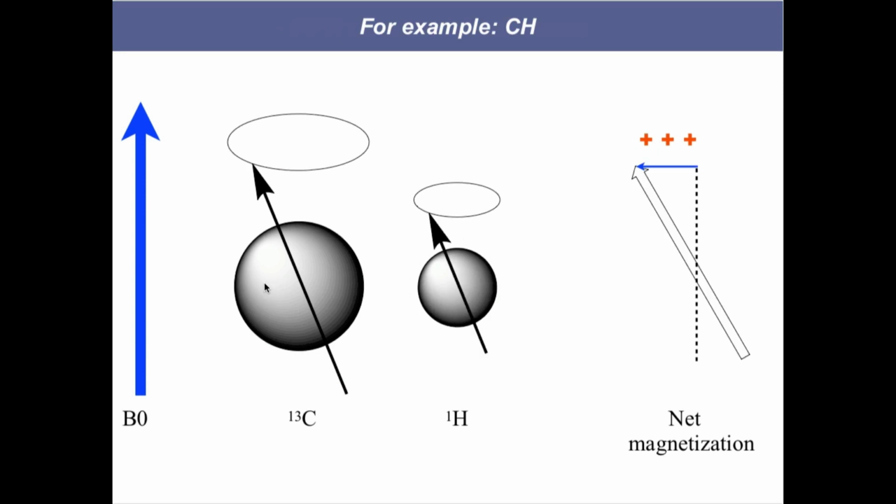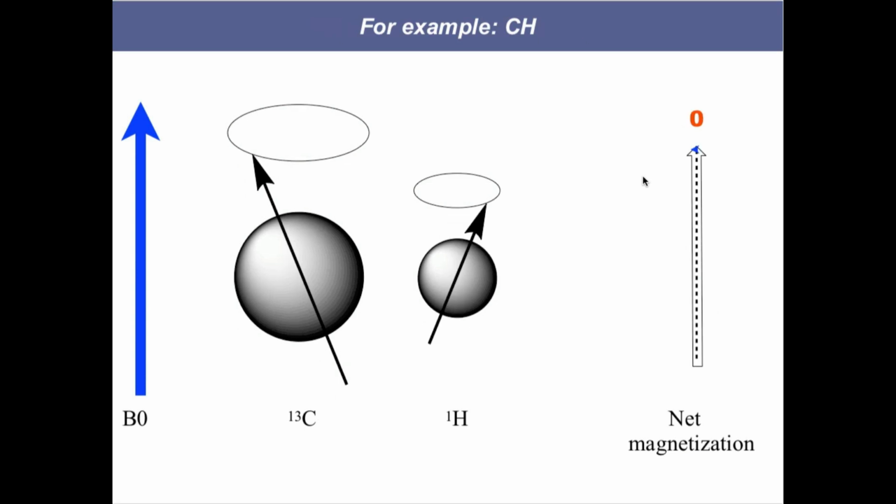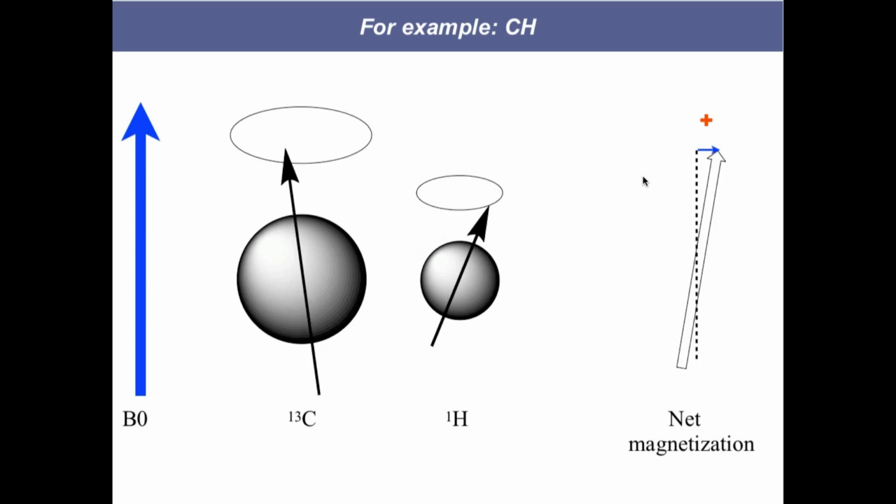So whereas before we had more magnetization, now we have less magnetization. If hydrogen keeps on spinning, we're going to have magnetization where maybe they cancel each other out. Maybe hydrogen ends up pointing opposite of carbon-13 at some point. Eventually, carbon-13 is going to catch up, and its precession will start to come into effect too, to the point that now we've got maybe a little bit of magnetization towards the right.